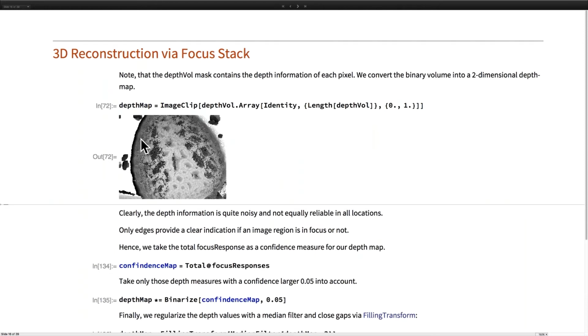And this is such a depth map. Well, first of all, where I have no object, it appears to go to infinity or stays at 0. So this white area is basically an area where I don't have any information. Here, however, I can see that in the dark area, these are pixels far away. And as I get to the center of the pollen, I see that I have pixels that appear to be very close. But then I also have pixels in between that don't really make sense, a lot of noise apparently.